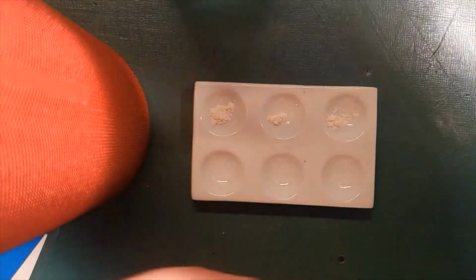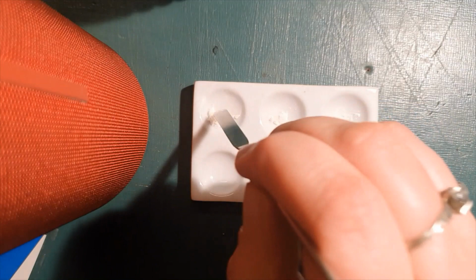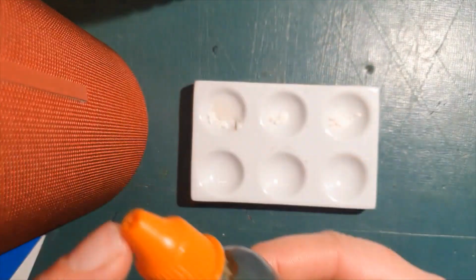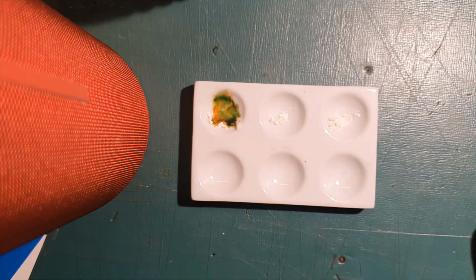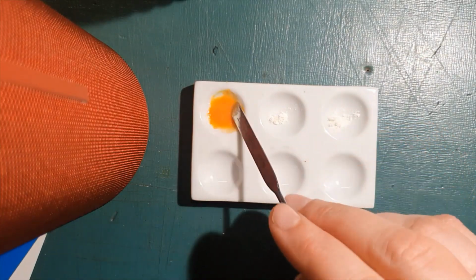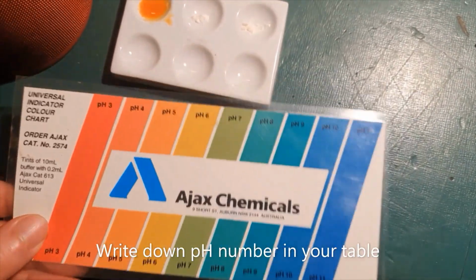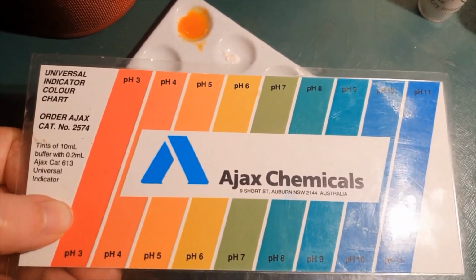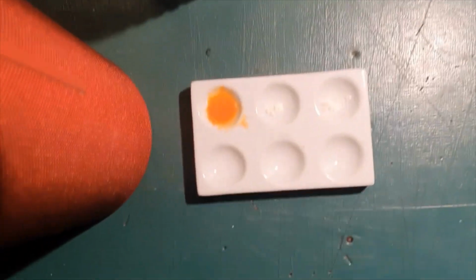Now, first one, let's put some water in there. Dissolve it in water. Great. Universal indicator, testing the pH. Ooh. All right. It's kind of orangey. All right. So please use your own discernment to decide which pH the flour is. What do you reckon? Write that down in your table.